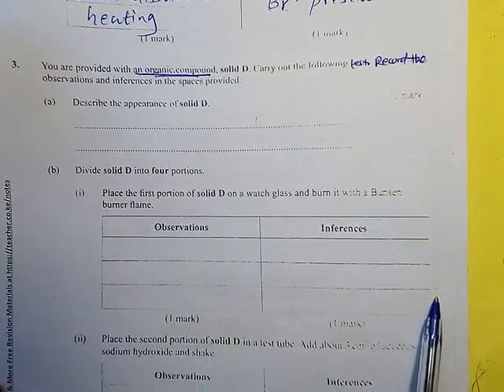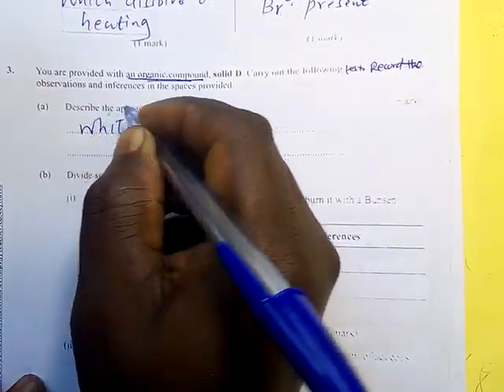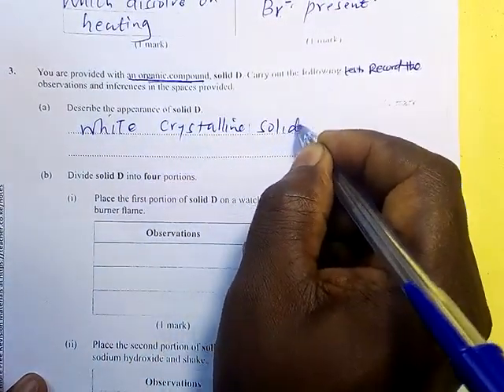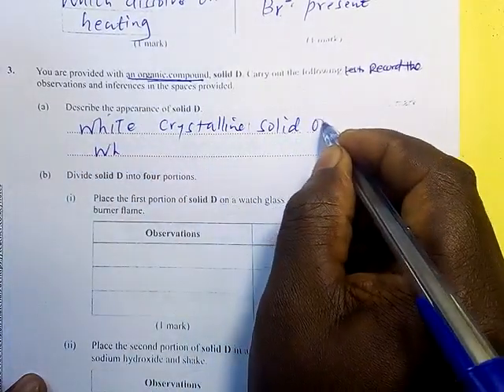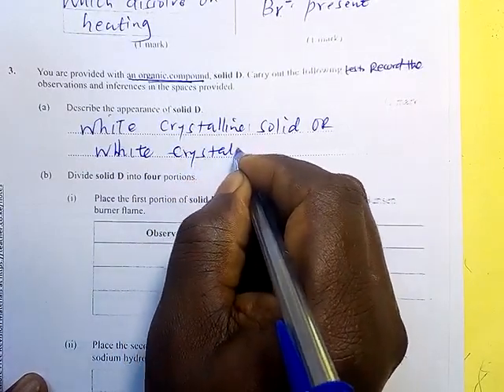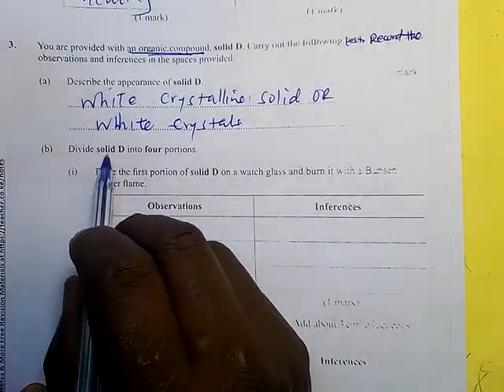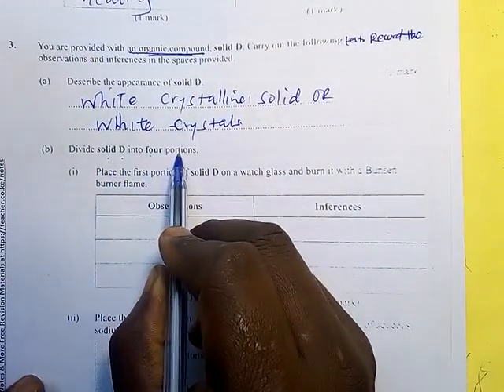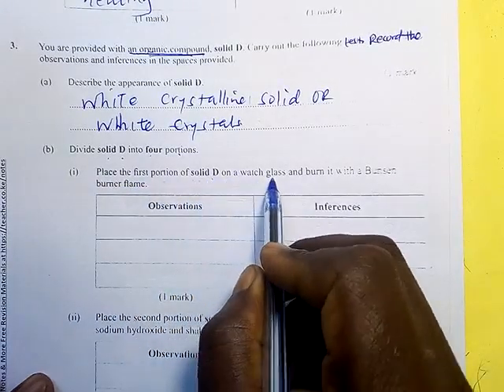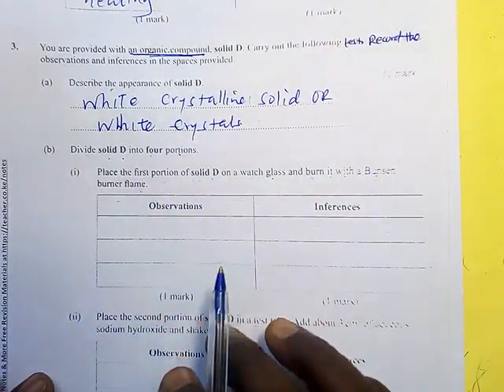Describe the appearance of solid D. It was a white crystal, therefore you say white crystalline solid, or you can say white crystals. You can say it is white crystals because the salt was white. Divide solid D into 4 portions. Place the first portion of solid D on a watch glass and burn it with a Bunsen burner flame.